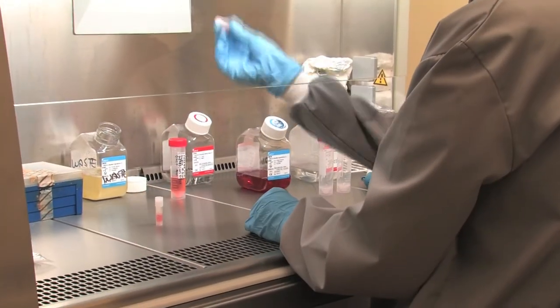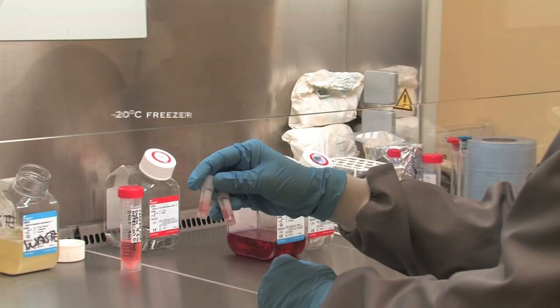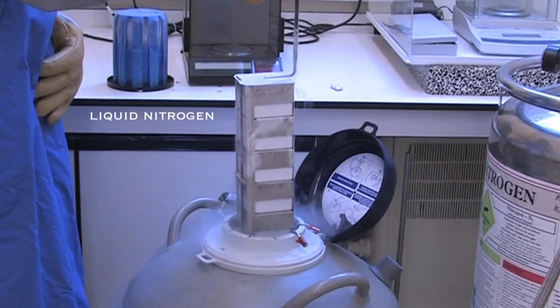The freezing process starts from when the cryovials are placed in the minus 20 freezer overnight. Subsequently, the cryovials are placed in the minus 80 freezer overnight. Finally, the cryovials may be placed in liquid nitrogen where they can be stored for an indefinite period.